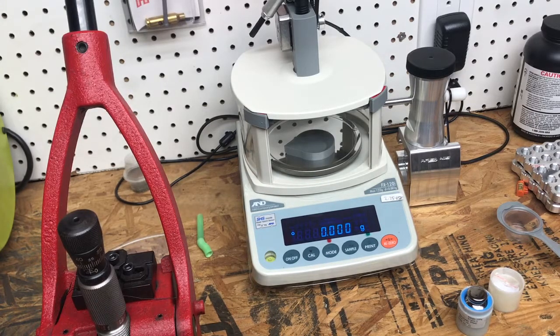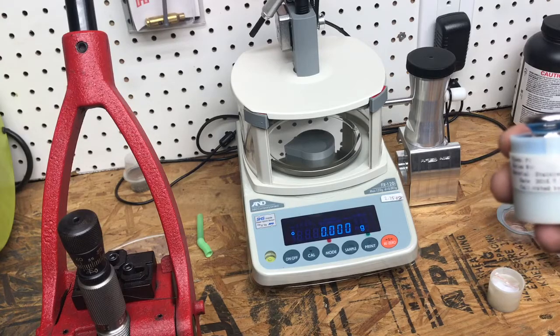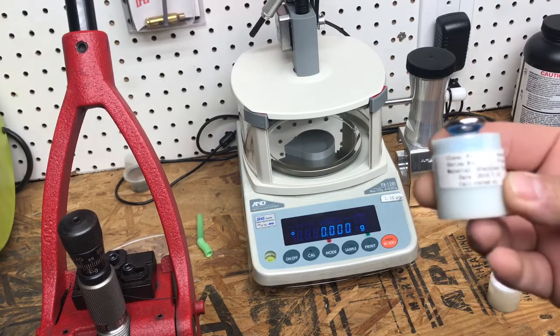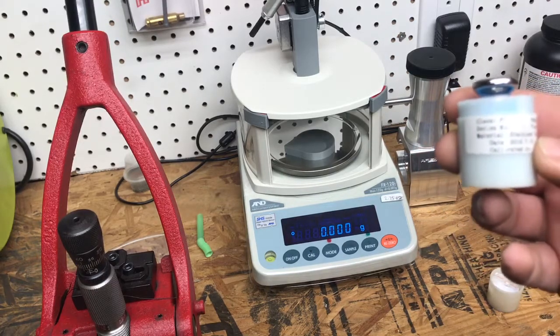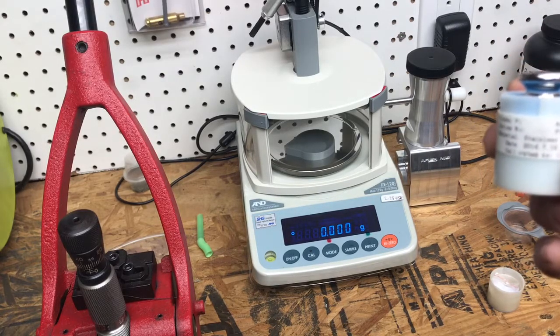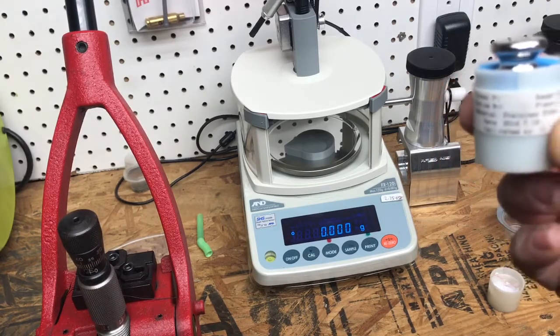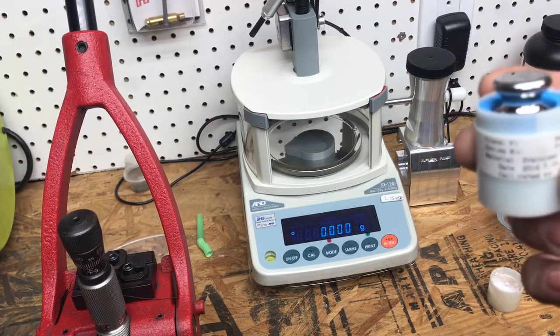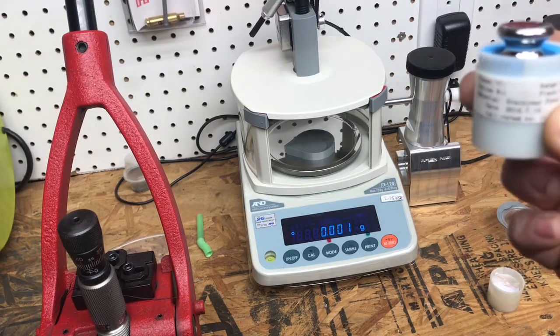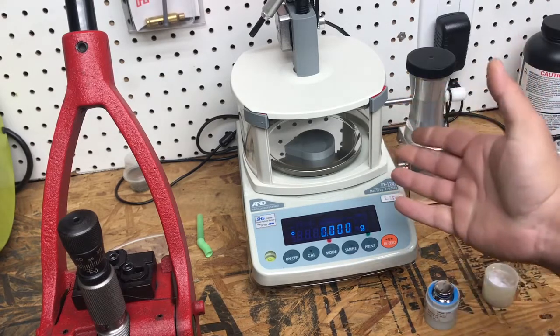Welcome back. This is a quick video showing how to calibrate an A&D FX-120i lab balance. The only thing you need is a Class F1 100-gram calibration weight — fairly cheap, about $18 off eBay from China. I've had this checked against a four-decimal lab balance and it was within Class F1 spec. Domestically these weights run about $80–100, but the eBay version is certified and only $18.